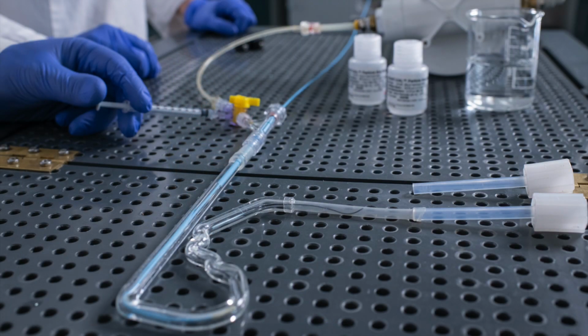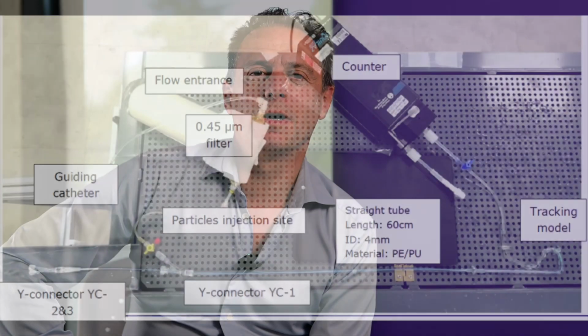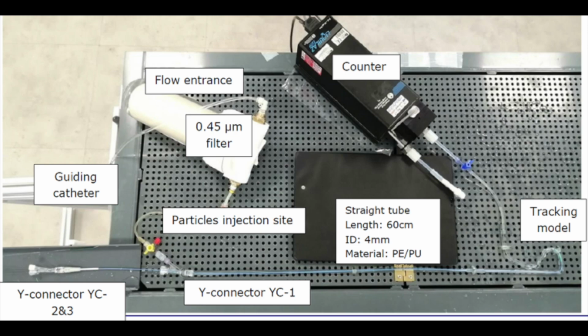The acute particulate matter evaluation studies are sensitive, as coating delamination can induce stroke risk in patients. This is why we're using acute particulate matter evaluation as a perfect example of how an interlab study can reduce patient risk. You don't have to go through 2 years of development to implement a test method validation before you can implement an ILS, interlaboratory study.